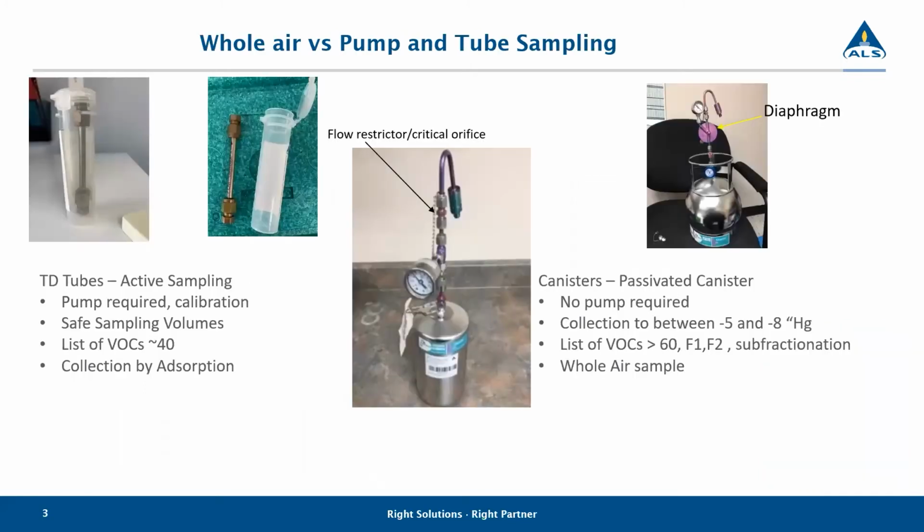So our thermal desorption tubes are of two different kinds. There's a multimedia tube, which we use for the active sampling, so that would be with a pump, and then our passive tubes, which just have a single media in them.